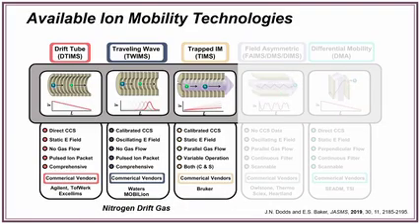All right, so to get everyone on the same page, because you might be coming from different backgrounds of ion mobility experience, there are three main types of gas phase, classical style ion mobility. The original one is the drift tube style ion mobility instrument. These were home-built instruments, the first that were used with mass spectrometry, and have been around the longest.